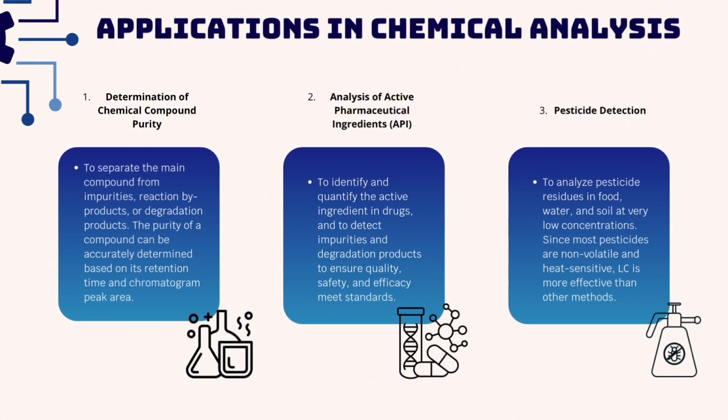Lastly, there is pesticide detection, to analyze pesticide residues in food, water, and soil at very low concentrations. Since most pesticides are non-volatile and heat-sensitive, LC is more effective than other methods.